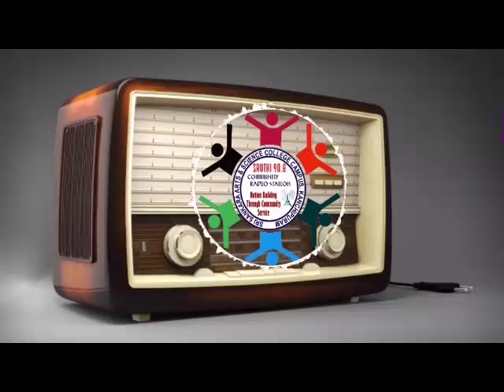Let us see the basic principles of bioreactor design. Before that, we should know the major function of the bioreactor. I already told you a bioreactor provides a suitable environment for the growth of microorganisms and can efficiently produce a target product. This is the major role of a bioreactor. So, with the help of a bioreactor, we can produce a large amount of cell biomass and cellular metabolites, and it is used for the conversion of many organic wastes into beneficial products.